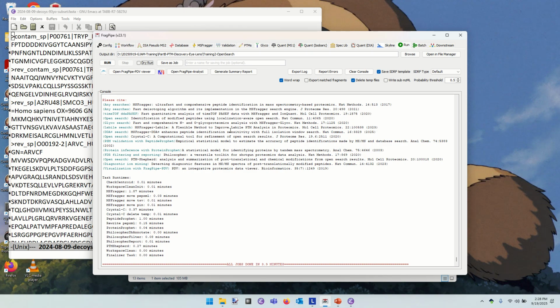All too often, we see publications in very major journals by very major groups that a very careful bioinformaticist can pick apart by saying, this mass shift that they're seeing is easily explained by this trivial phenomenon, not what they've claimed, which is that they've validated a rare mutation in this particular tumor or whatever. This stuff happens all the time. So finding the most boring possible reason to explain your mass shifts is not gratifying, but it will protect you from making a silly statement in press.